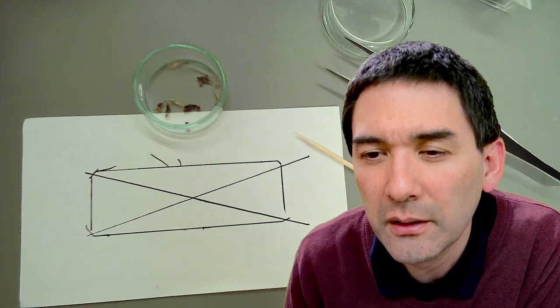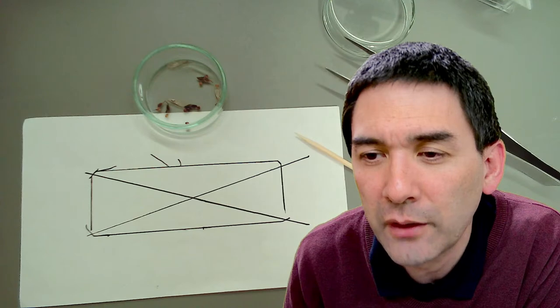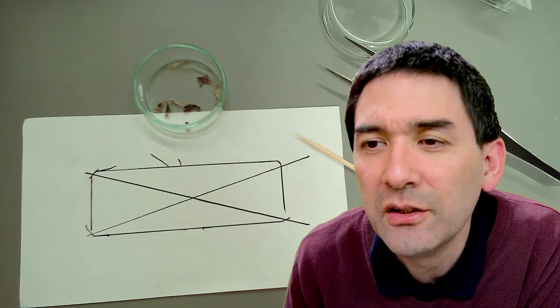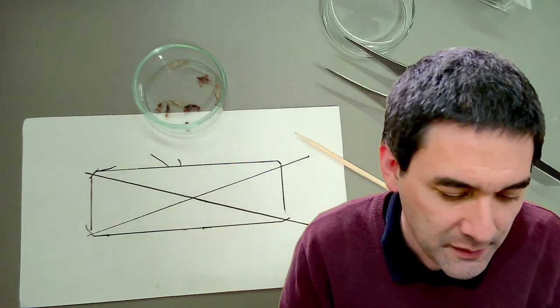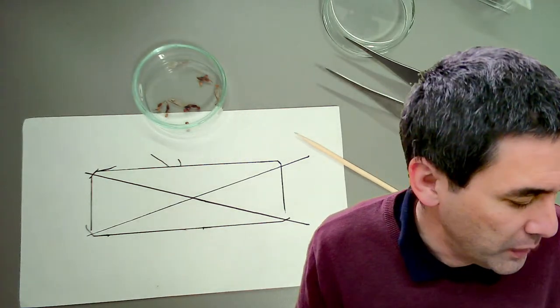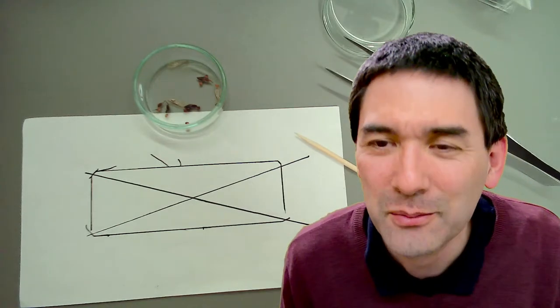I use them. Okay. Yeah, I recently purchased some prepared slide boxes. Luckily I got some round cover glasses and some slides to prepare my own. It was a nice surprise since I didn't know it was included. Yep, sometimes they actually come with a few blank slides. Okay, so I'll do the following. I'm just going to move on. Just make sure that the dirty ones are out of my way. I don't want to see them anymore. And let's move on a little bit.